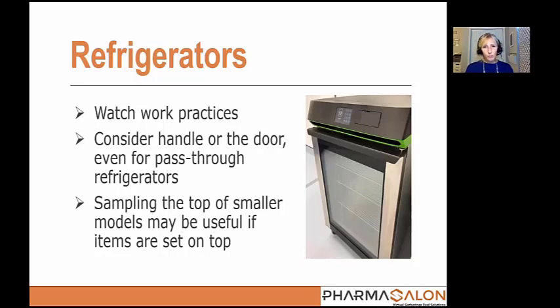This particular picture, you're seeing more of a smaller counter height type unit. If people are going to be putting things on there and staging things that are going to ultimately end up in the buffer room and in the primary engineering control, it might be useful to sample the top of that, depending again on how that's going to be used. You might not know that until you go in there and kind of watch how people are actually working.